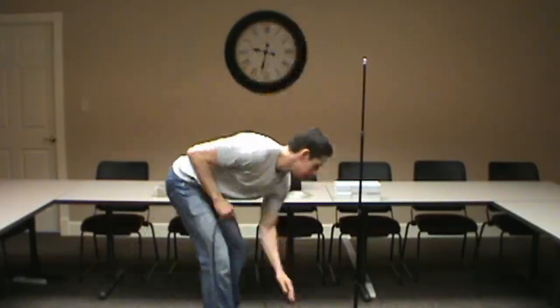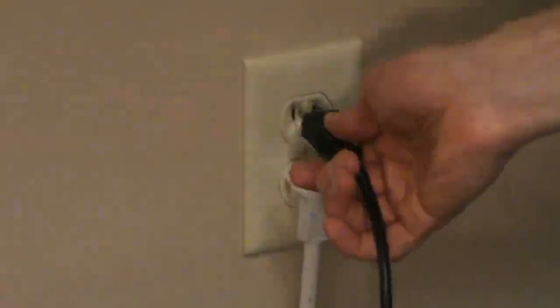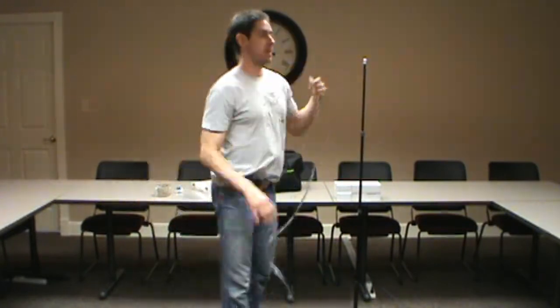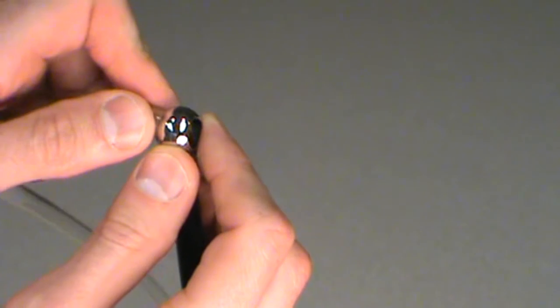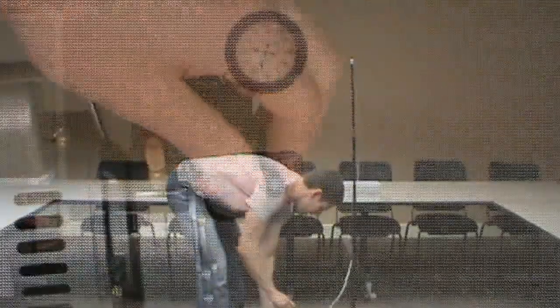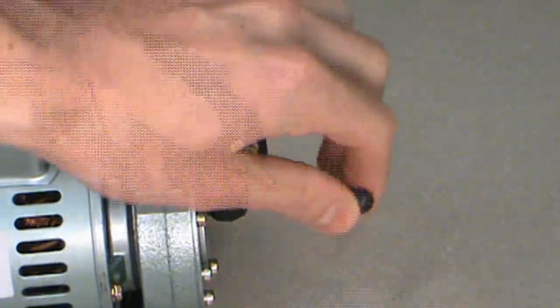Unpack your vacuum pump and plug it in. Thread one end of the plastic tubing through the top of the tripod and connect the other end to the nozzle on the vacuum pump.